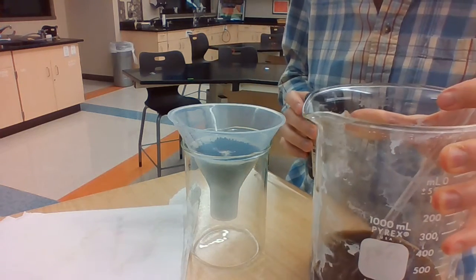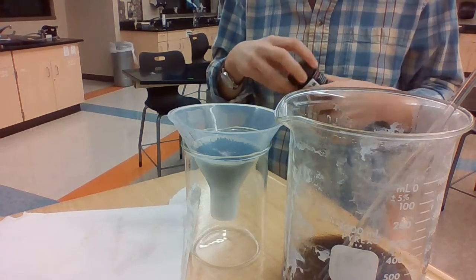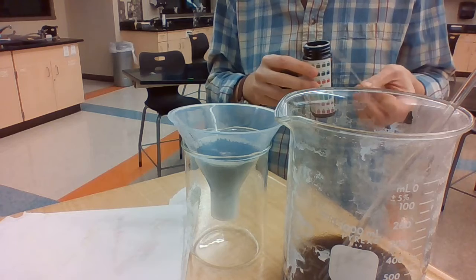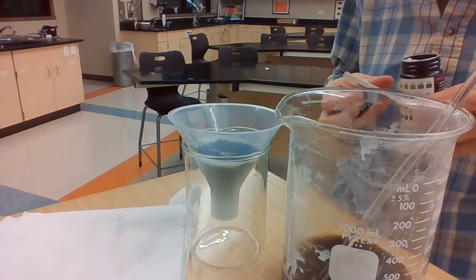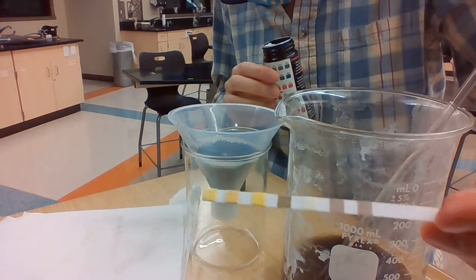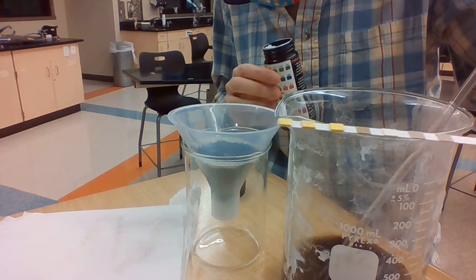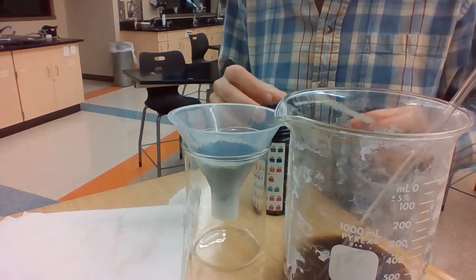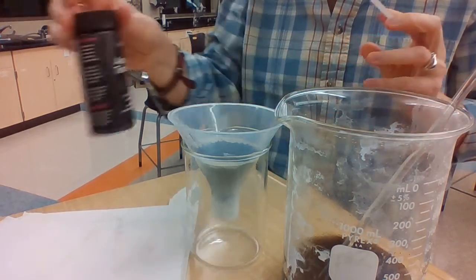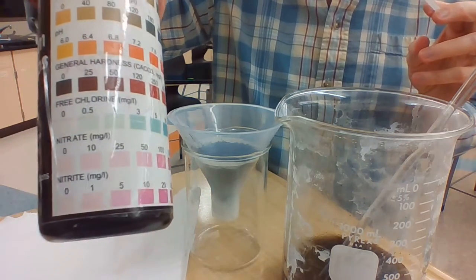While that's filtering through, I'm going to use a little aquarium test strip to test the quality of this gross contaminated water. Then hopefully we'll get enough coming through my filter that I can test the quality of that without waiting too long on our video. This little test strip has little squares of chemicals on it, and I'm going to dip it all the way into the gross contaminated water and let it sit for 30 seconds. Then we're going to compare with the colors on the bottle to test things like alkalinity and nitrates and chlorine and all of that.